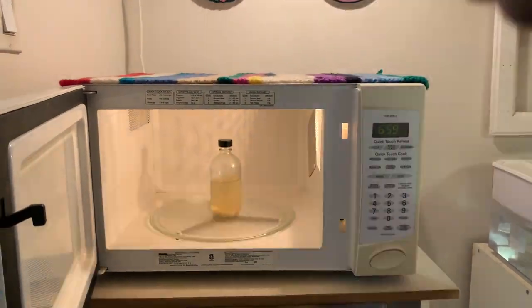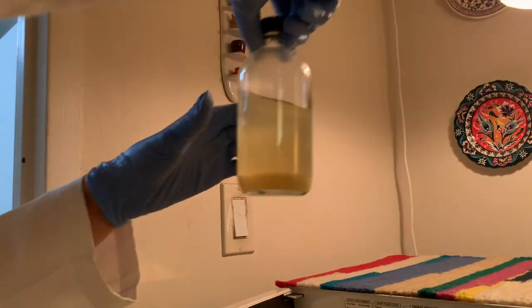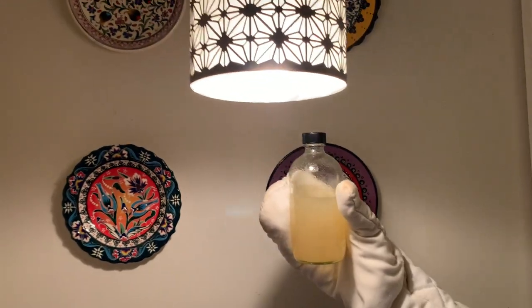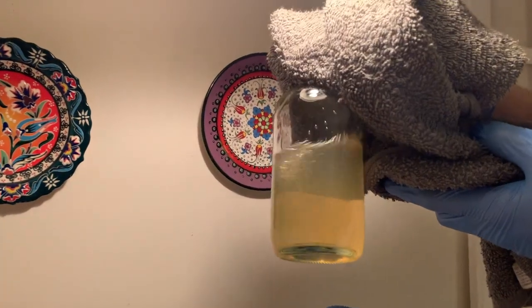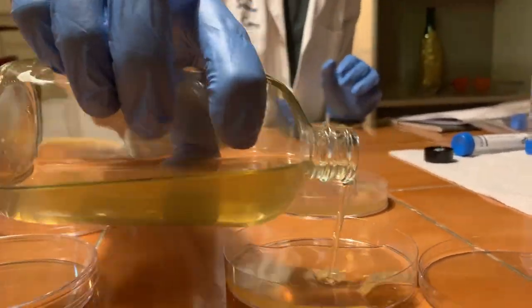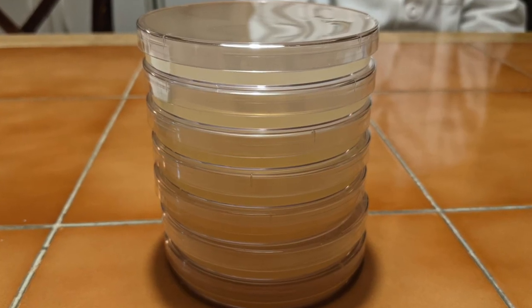Next, I had to cook the agar solution in my microwave. While microwaving, I had to check if it started boiling or not. As I kept repeating this process over and over again, the solution started getting more and more transparent, and when I could see no more solids inside the solution, I knew it was done. I then poured the solution into some empty plates and let them sit overnight in my fridge.